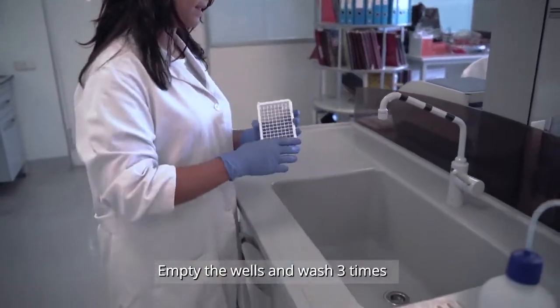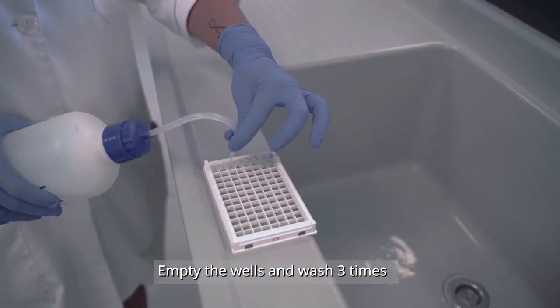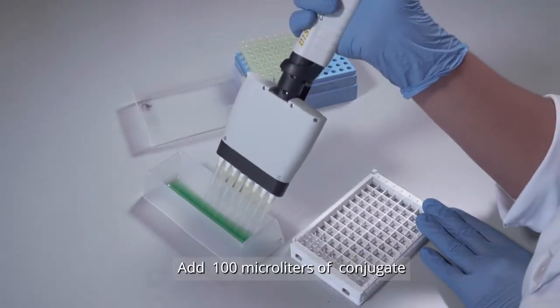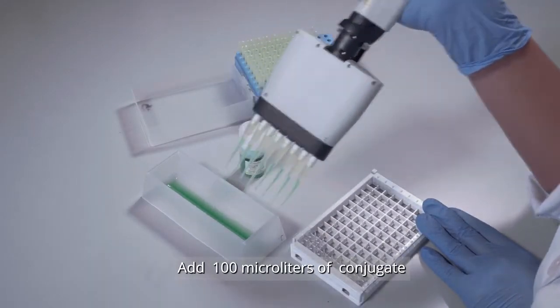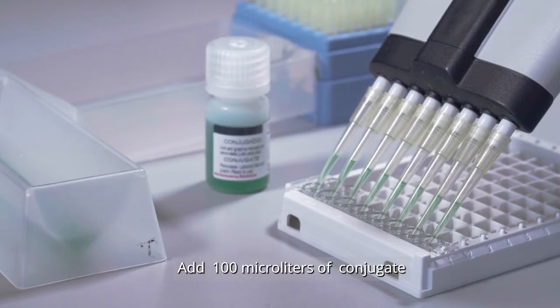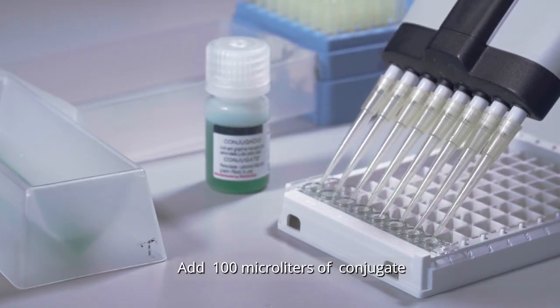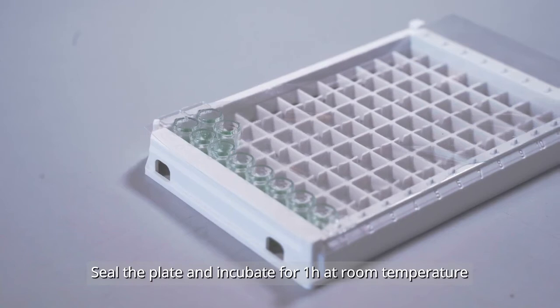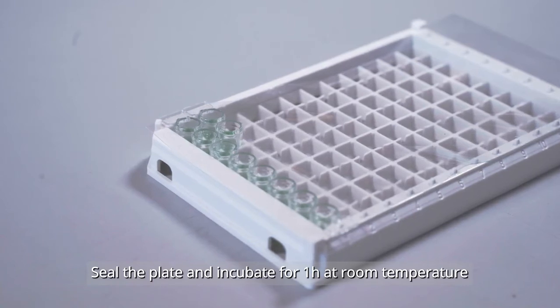Empty the plate and repeat the washing step three times. Add 100 microliters of conjugate. Seal the plate and incubate one hour at room temperature.